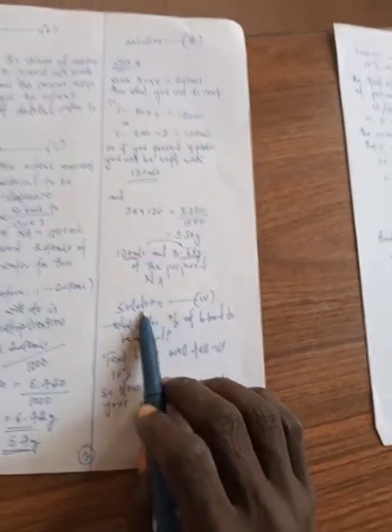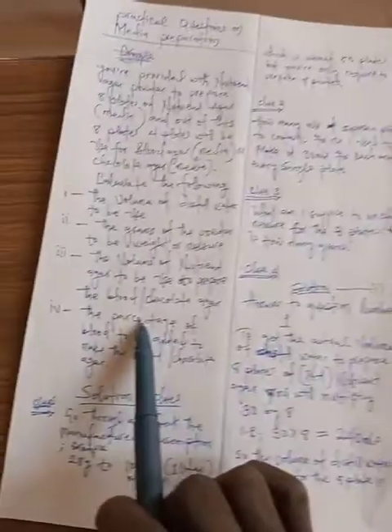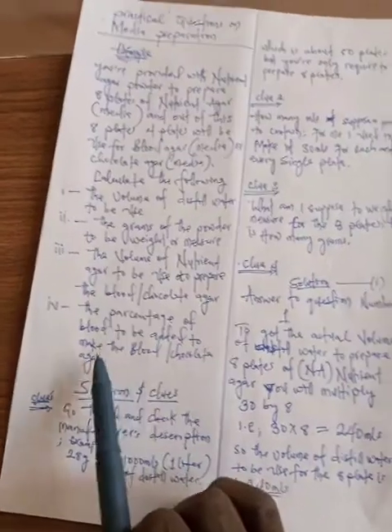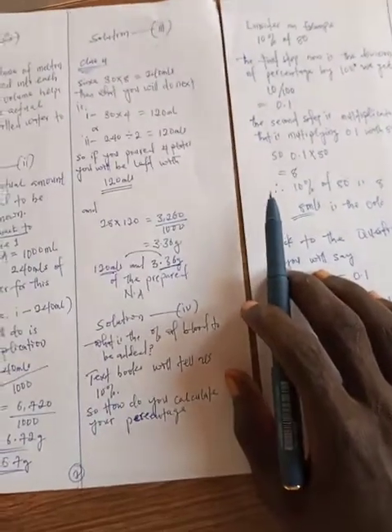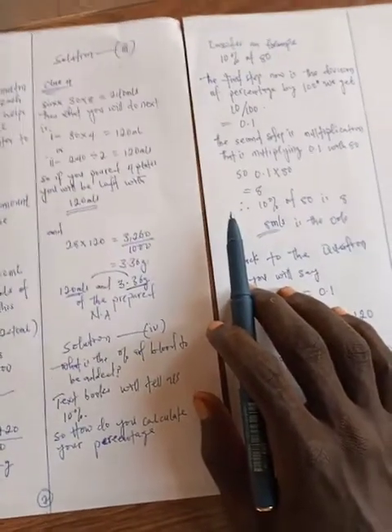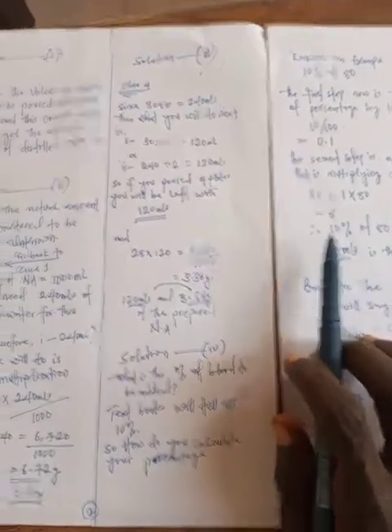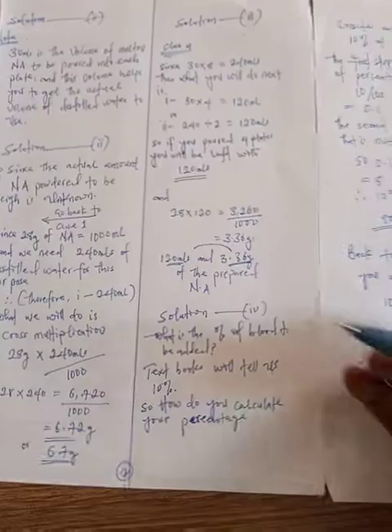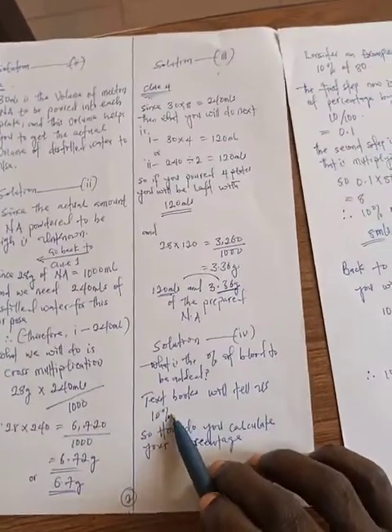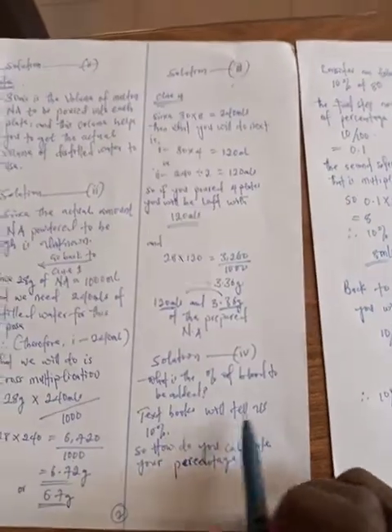So question number 4 says, calculate the percentage of blood to be added to make the blood or chocolate agar. Since blood or chocolate agar requires the addition of blood into the nutrient agar, how many mils of blood do we need in order to make this blood agar? So according to the textbook, they tell us that we need 10%. So now, how do you calculate your percentage?